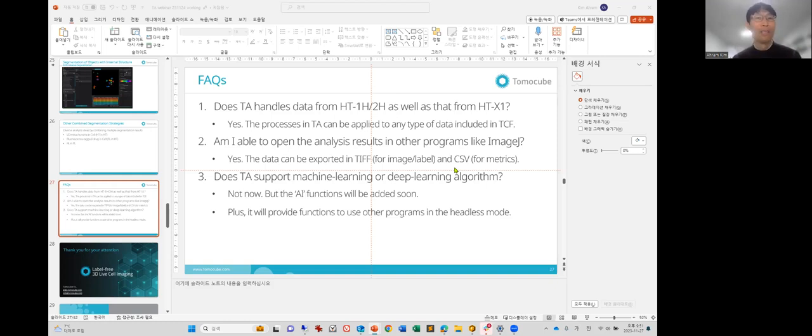of each droplet. So in our process, we neglect those small droplets, because sometimes lipid droplets can be confused with other small entities in cells. It depends on your choice, but the default pipelines that we provide at the moment filter out small LDs, usually smaller than 0.2 or 0.3 micrometers.